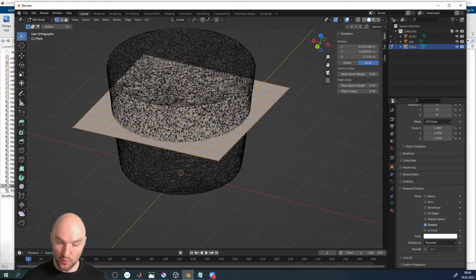For now, we also still have something that's just a plane. So if you have a plane or something that just has one curvature, you can actually have even distances between the mesh points. If you have something that's curved in 3D, that's in principle not possible. You cannot have something curved in 3D where you have even distance between the mesh points. So this is also something you need to be aware of. Yeah, so these nice square looking things, we're not going to work with something that's very curved in 3D.